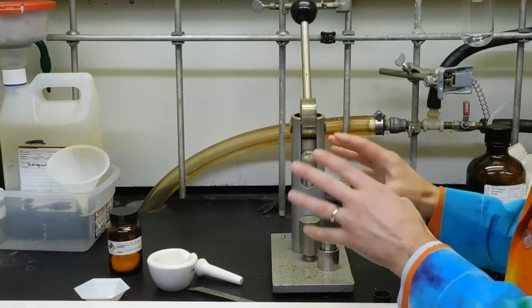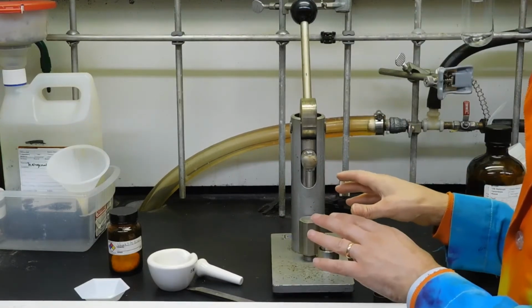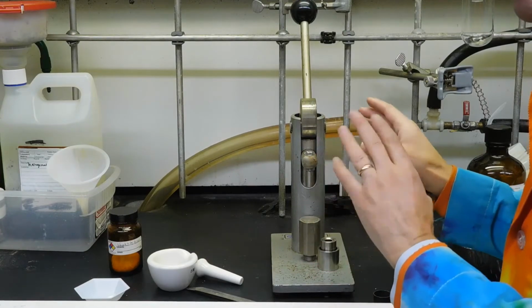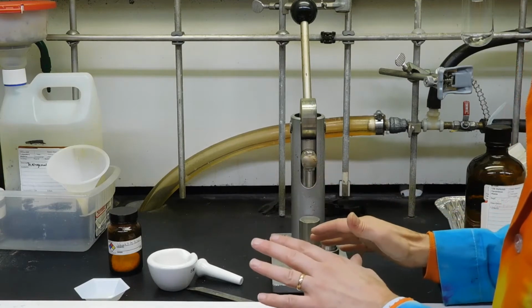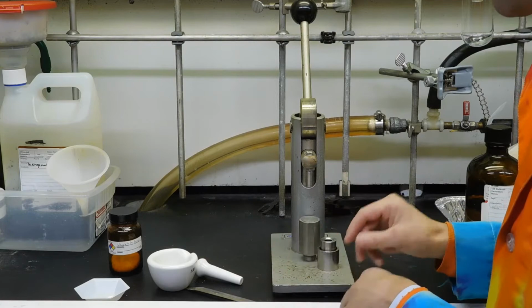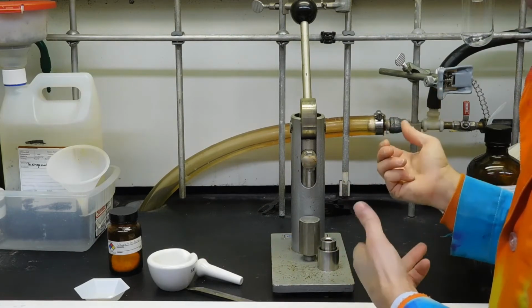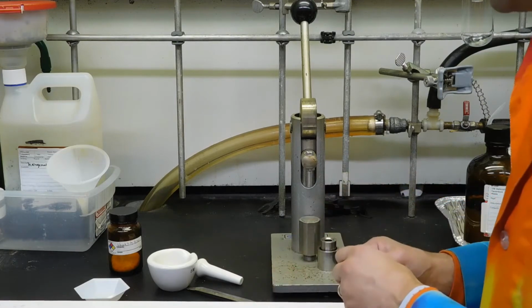I've done this a couple times to get the settings right, but what you should do is clean everything. Wipe them out, make sure everything's clean and doesn't have residue from some previous job. And when you're all done, clean it off well. You can rinse it off with ethanol into a non-halogenated waste bin.